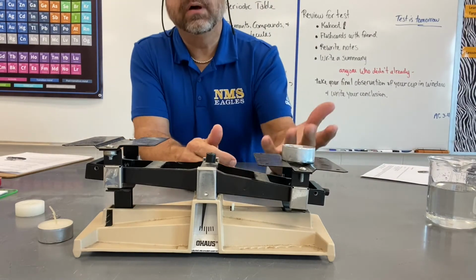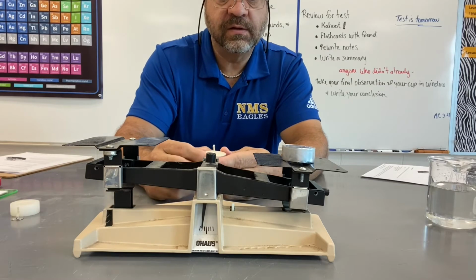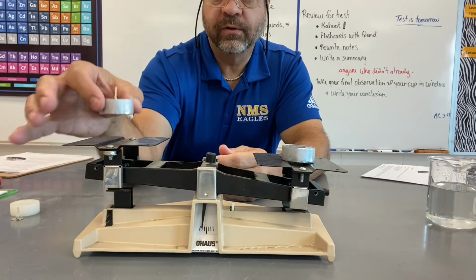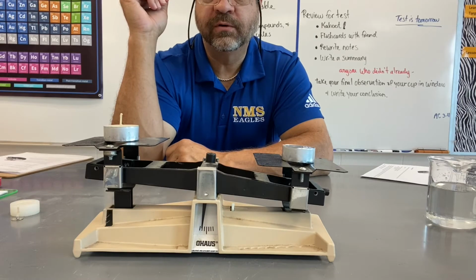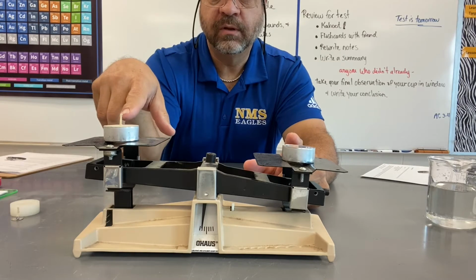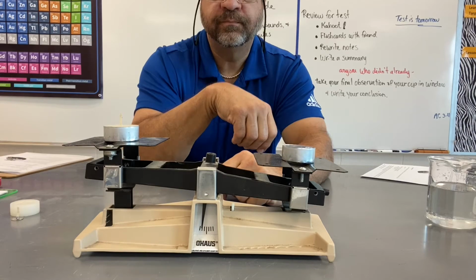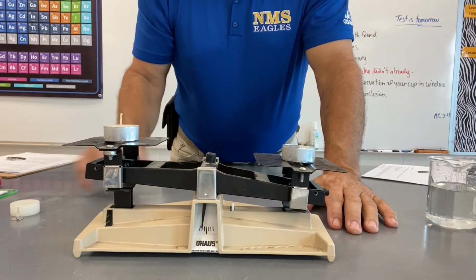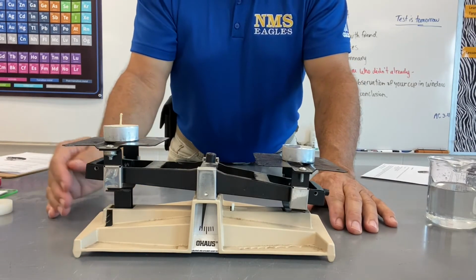All right, so we have a cup full of water here, and our examination is to see if that same volume of wax is heavier than the water or lighter than the water. So here comes the tea light. Okay, and what do you observe? I've got water on this side, the same volume as I have of wax on this side. So hopefully you see that the water is apparently heavier than the wax is because it is weighing down the balance here.